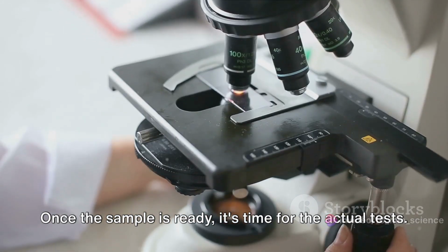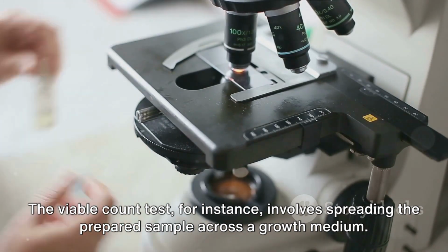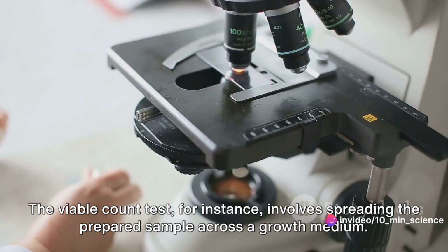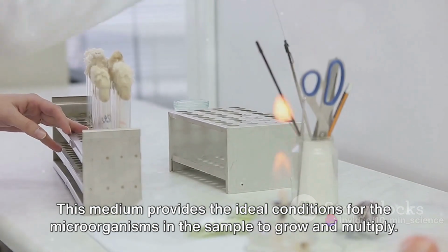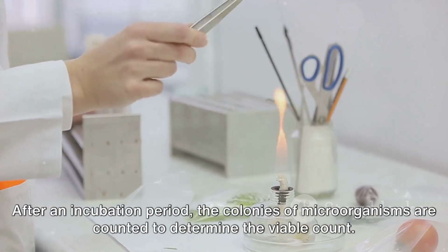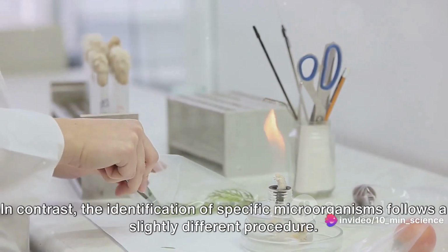Once the sample is ready, it's time for the actual tests. The viable count test, for instance, involves spreading the prepared sample across a growth medium. This medium provides the ideal conditions for the microorganisms in the sample to grow and multiply. After an incubation period, the colonies of microorganisms are counted to determine the viable count.